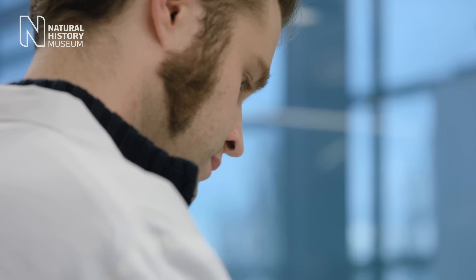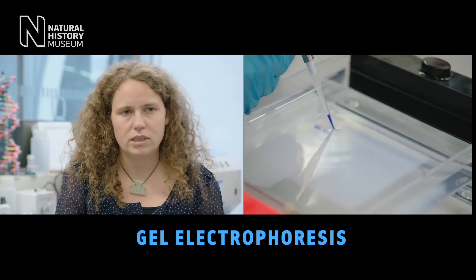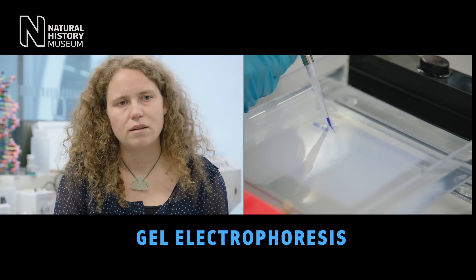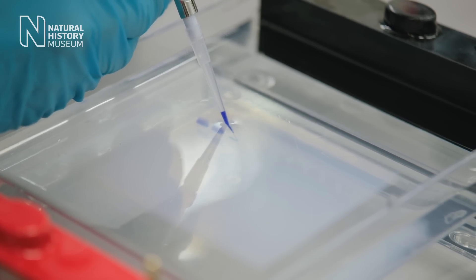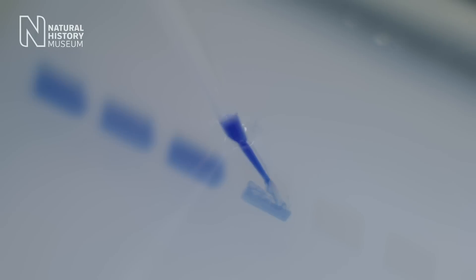After the PCR, we do a gel electrophoresis. It's a method where we run the DNA fragment on a gel through a matrix, and after we've run it through, we compare the size. This is done by comparing the size of our PCR product with something called a DNA marker, which is basically like a ruler on the gel.